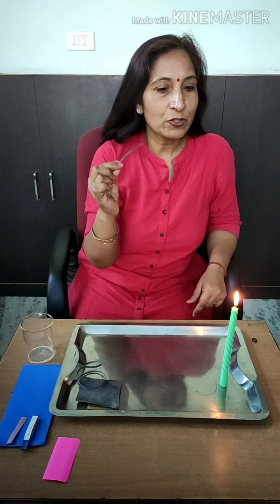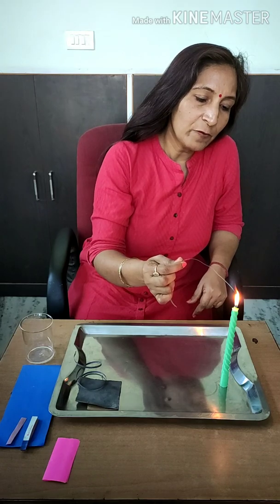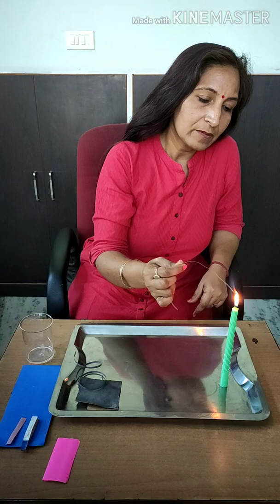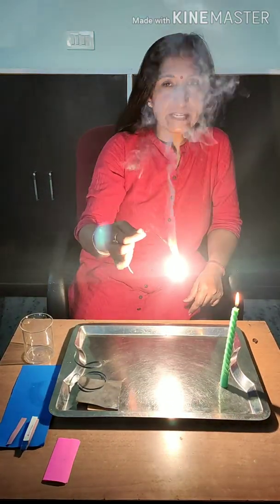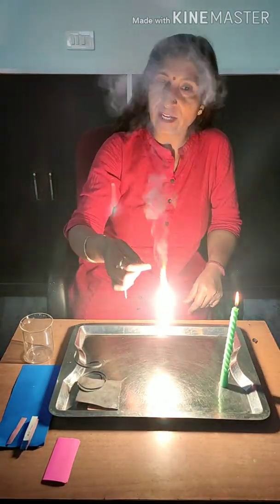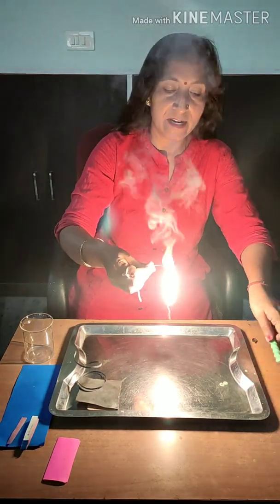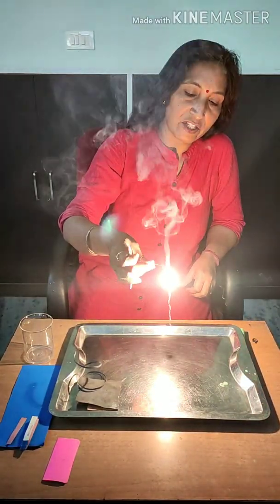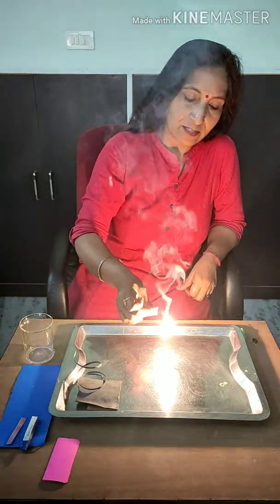Now I am going to burn it. This will burn with a dazzling white flame and its intensity is very high, so one should not gaze at it. Even I am also not looking at it directly. A white ash is getting formed.